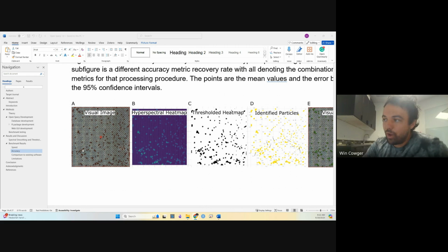And then you'll move up to the next spot and do it again up here in this region, and then do it again up here. With a focal plane array, because there are so many measurements happening at once, you go really fast. Another thing you can do is a linear array, where the region you're looking at is smaller, but it also goes quite fast.